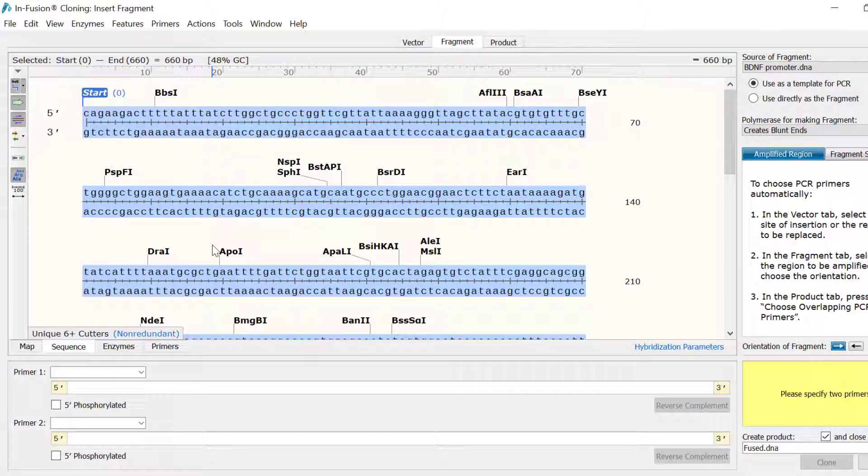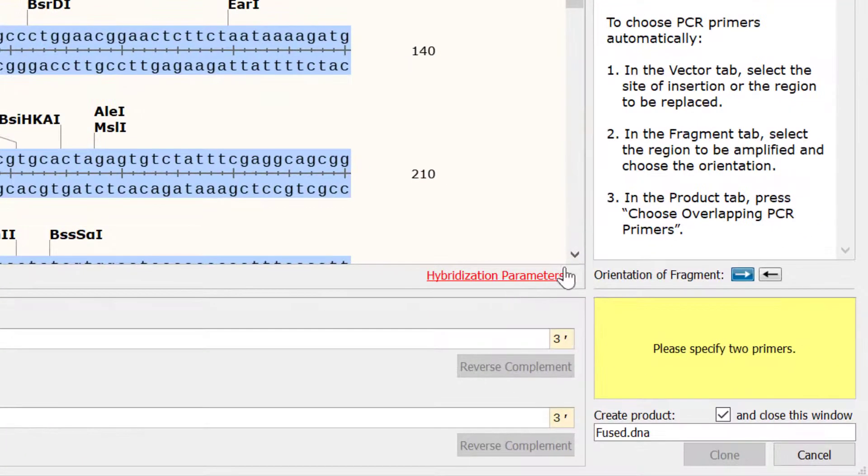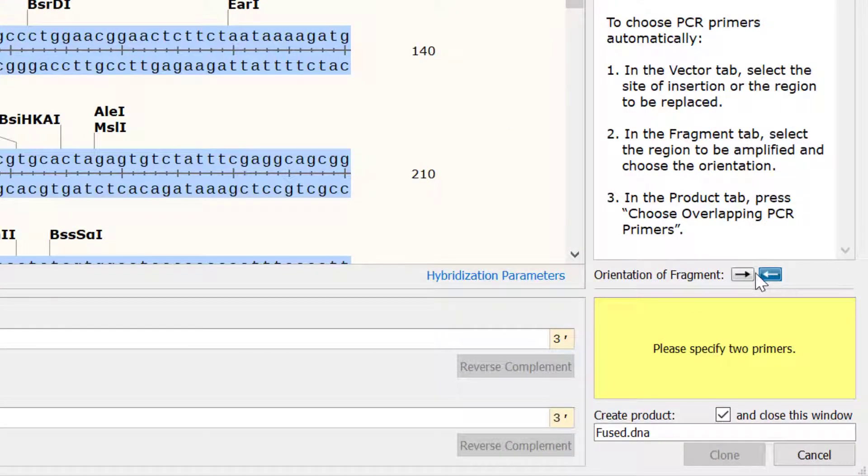If you need to change the orientation of your insert, you can flip your sequence using the buttons to the right.